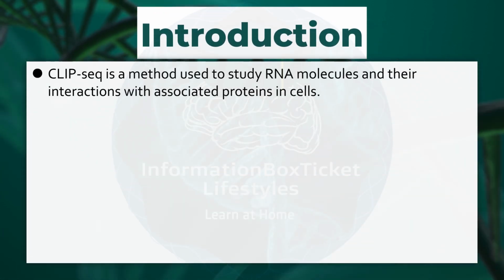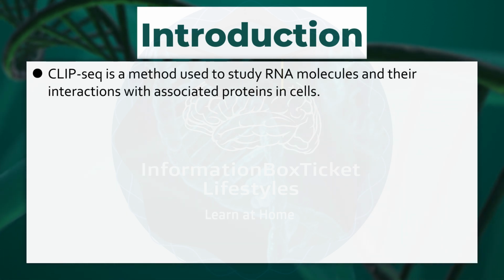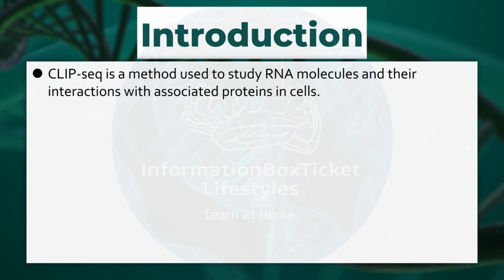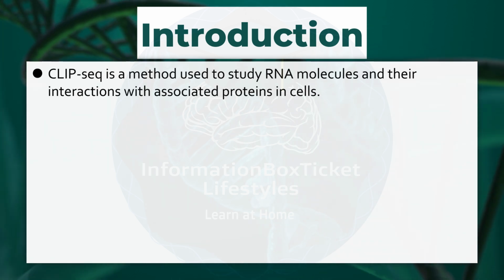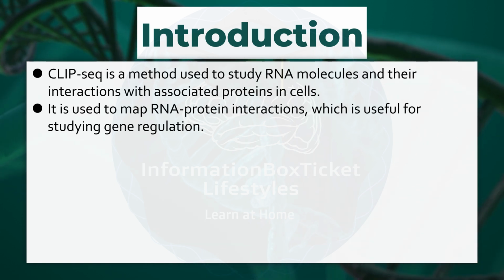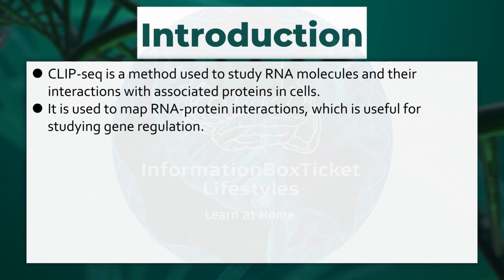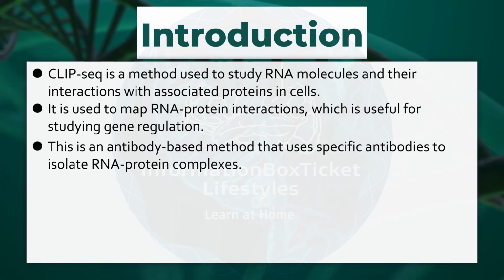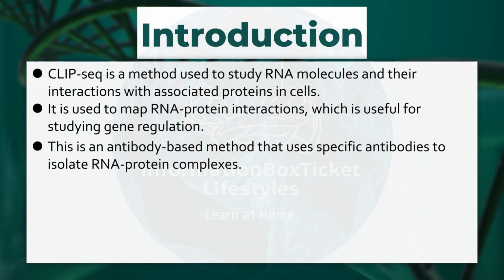Crosslinking and immunoprecipitation sequencing is a method used to study RNA molecules and their interactions with associated proteins in cells. It is used to map RNA-protein interactions, which is useful for studying gene regulation. This is an antibody-based method that uses specific antibodies to isolate RNA-protein complexes.